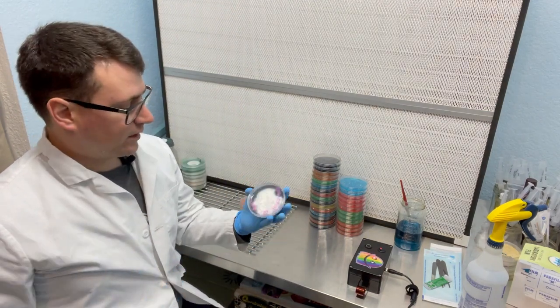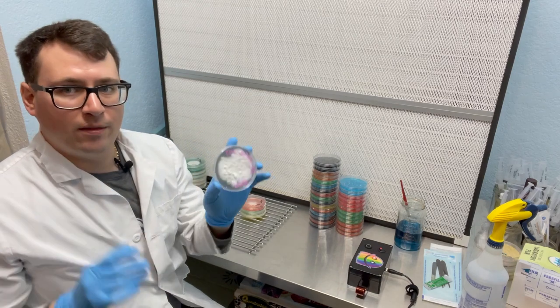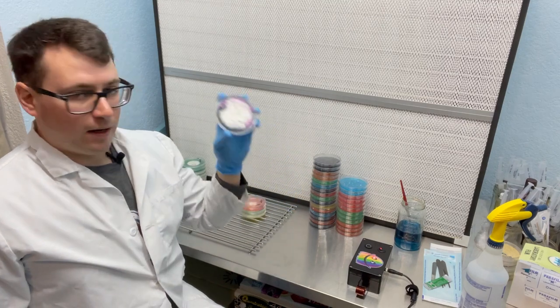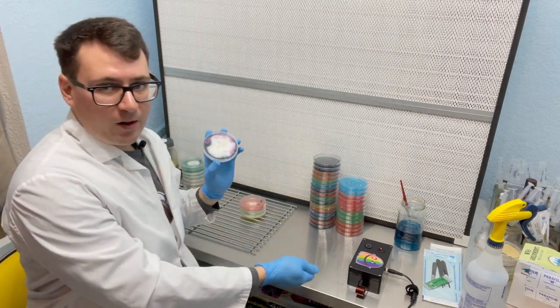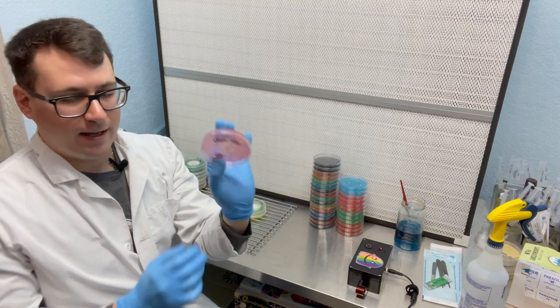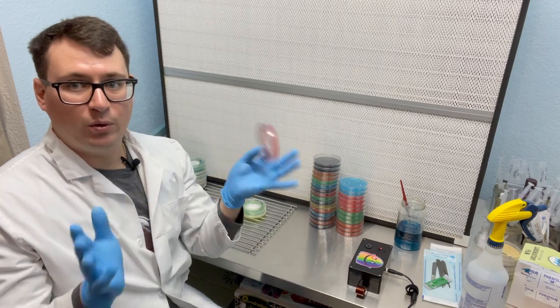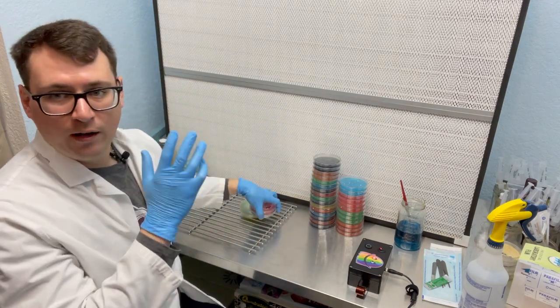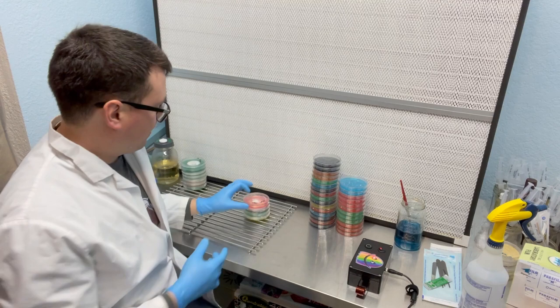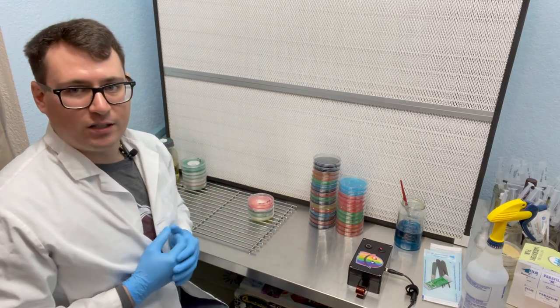For example, I'll start off with this King Stropharia here, and it's got tomentose, slow growth, very distinct on agar. I'll transfer about 4 or 5 dishes from this culture, sterilize, and then move on to this lion's mane culture, which has really filamentous growth. It's very distinct on agar. Lion's mane looks completely different. And then I've got a couple more strains that have different, very characteristic mycelium. The rhizomorphic mycelium from the rest of my strains is pretty obvious too.